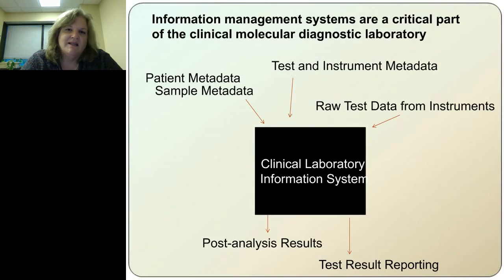Most of us think, at least people who are functioning in clinical laboratories, if you're not directly involved with the maintenance and action of a clinical laboratory information system, you think of it as a black box where you have patient metadata, test and instrument data, raw test data from instruments, post-analysis results, and test result reporting all coming out and surrounding the clinical laboratory information management system.